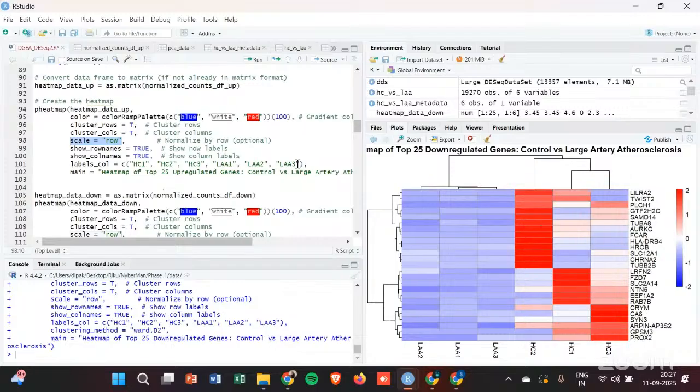In none of the steps were we removing any outliers, we were just accounting for them. But how much accounting is too much accounting? You can never account for all the effects those outliers will cause, and that is exactly why if you have a lot of outlier genes, not samples, outlier genes, you will have log fold change values which are extremely high, such as 15, 16, 17, 20, 25.